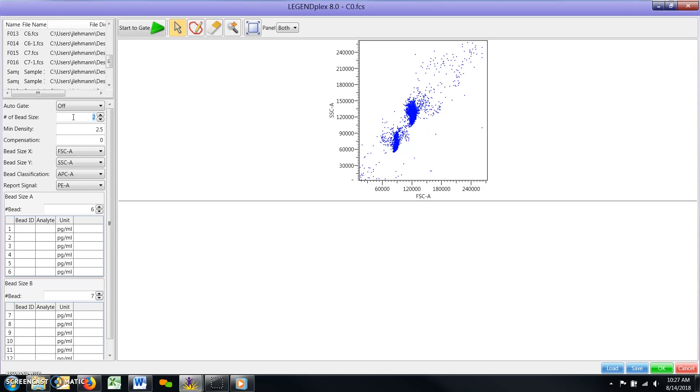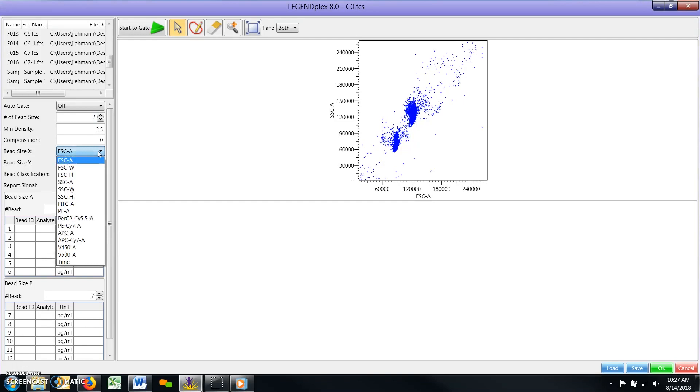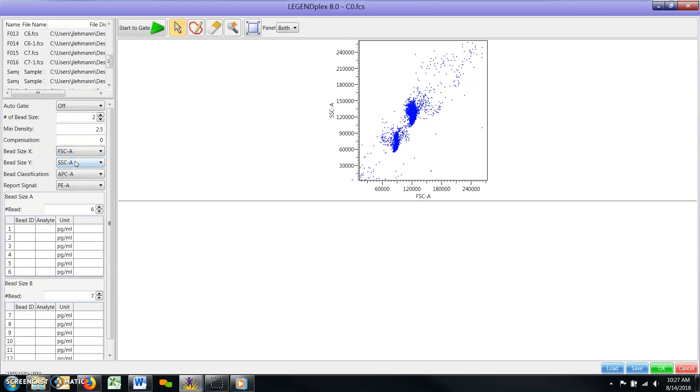Scatter Plot Parameters. For Bead Size X, select the forward scattered parameter used during your acquisition on your flow cytometer. For Bead Size Y, select the side scatter parameter.